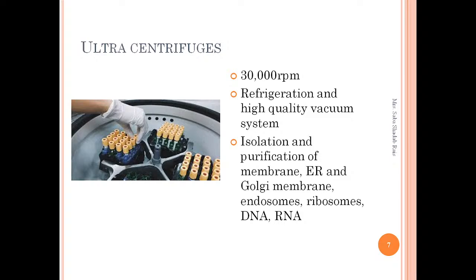So, in spite of doing a big protocol, which you don't have in your syllabus, SYBSC has DNA and RNA separation in the syllabus. Instead of following such a big protocol, you can just do centrifugation. With the help of the centrifugal force, the biological sample is not only sedimented but also separated. So this is all about centrifugation.